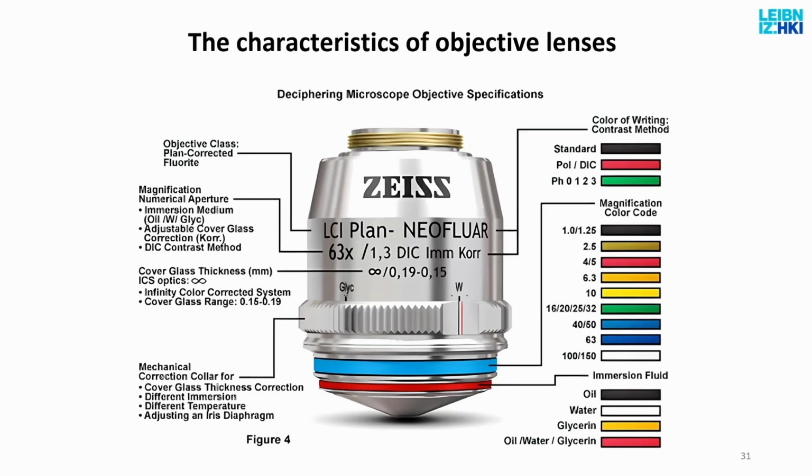This is what your objective is, that's screwed into your microscope. Before you start your experiment, you have to know what your lens is capable of. This will determine everything that you can make it do. Once again, like we talked about the engines, this is the main part around which you draw the lines. If the lens cannot do it, no matter how expensive a microscope we have behind it, we cannot. Most of these we will talk about, but briefly I wanted to go through that.